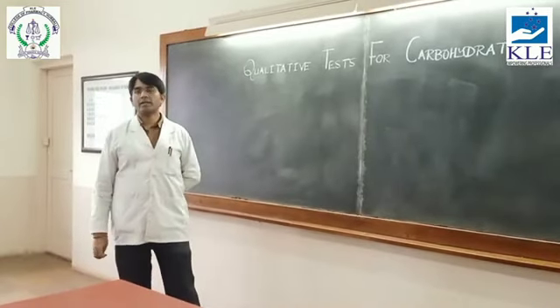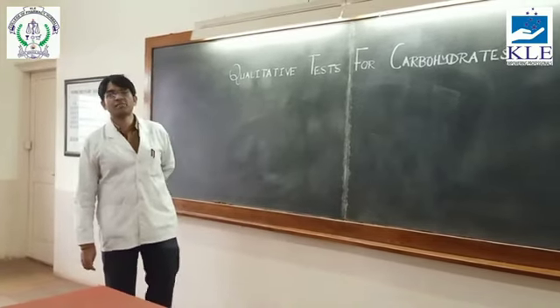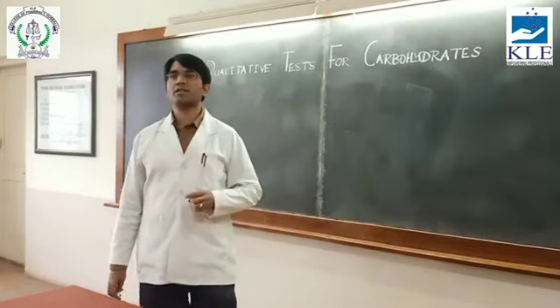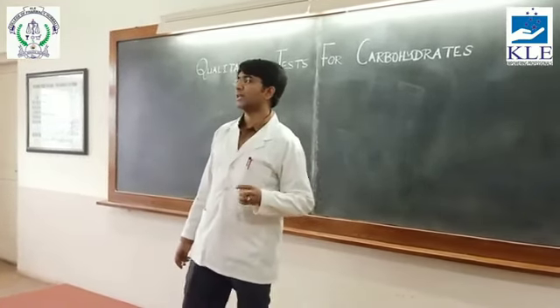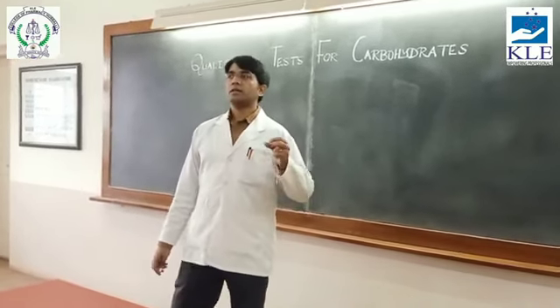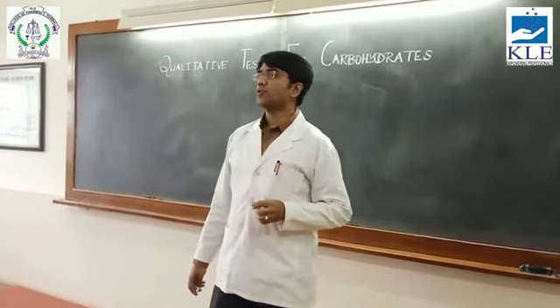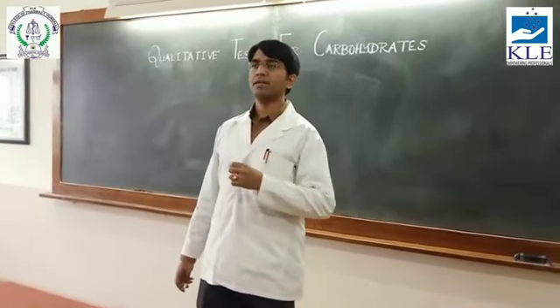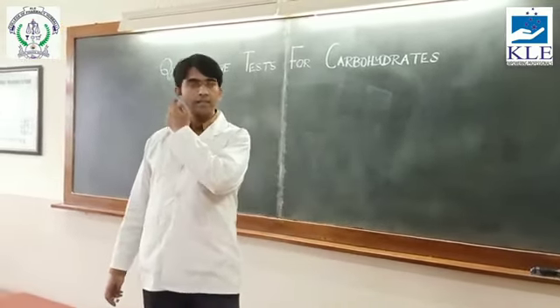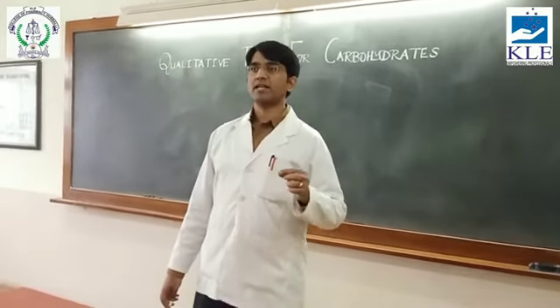Today, along with my degree students, B.Pharma students, I am here to give you the demonstration with respect to the qualitative test for carbohydrates. As all of us know, carbohydrates are polyhydroxyaldehydes or ketones, or compounds obtained after hydrolysis of these. So there should be some methods which can be used for identification of whichever sample is given to you as a carbohydrate. For that reason, there are some assigned qualitative tests which we can carry out to identify the sample given to us.